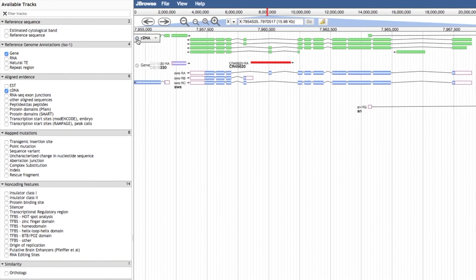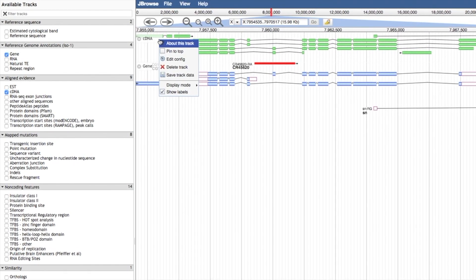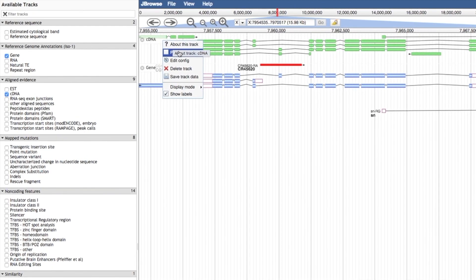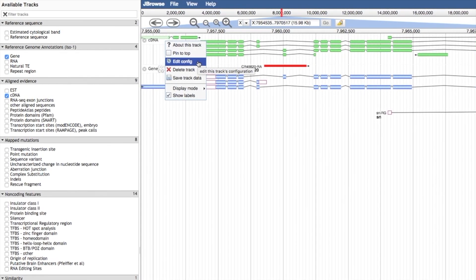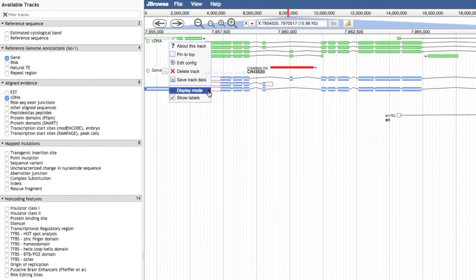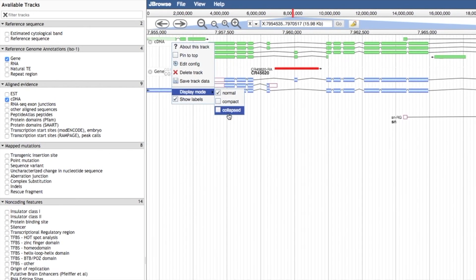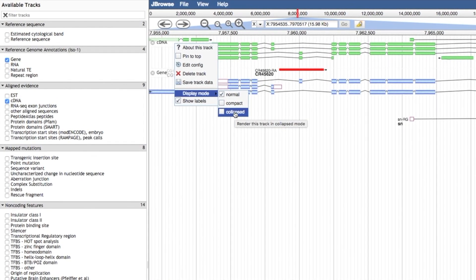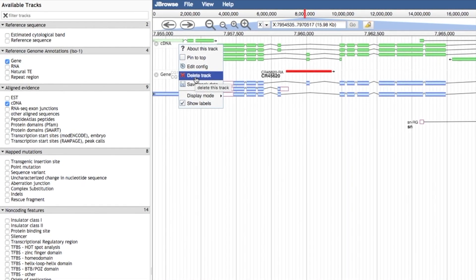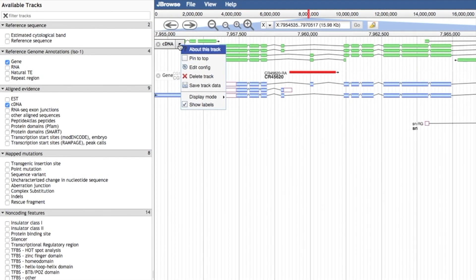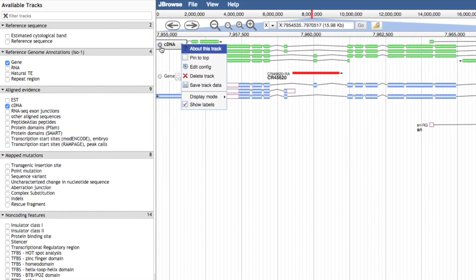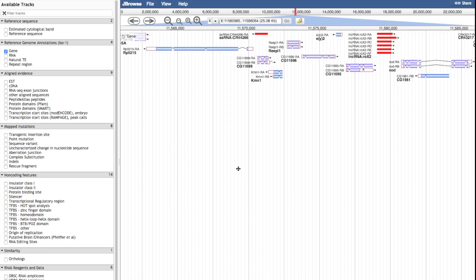The dropdown menu on the track title gives you various options, including pinning a track to the top of the genome browser view, saving particular track data, or changing the display mode to suit you. If you use this menu to delete a track, it also removes it from the left-hand side of Available Tracks. You will need to refresh the page to restore default tracks. You can also remove a track by clicking X in the track label panel within the genome viewer.